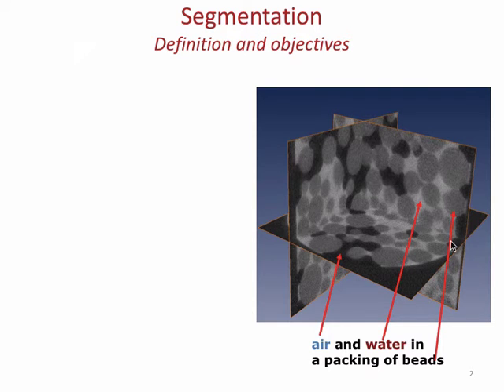When I look at the histogram, I could say I see two or three phases in there, but separating means nothing here, because I'm going to pick up these reflection parts as too dark or too light, and they can actually be very physically wrong.